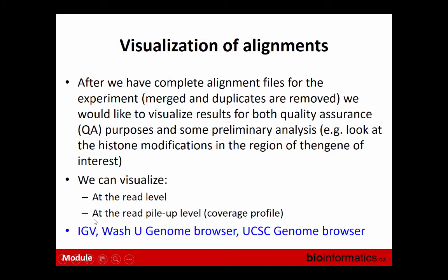So why is visualization important? Because it's very important. Unfortunately, what we are doing, and I'm using this term very vaguely, when we are looking at ChIP-Seq data and a lot of other next-generation sequencing data, it's deep learning. Human interaction is very, very important. We know very little about what to expect. We don't have a theory behind our data. Therefore, as soon as data is out, everybody is eager to look and see how it looks.